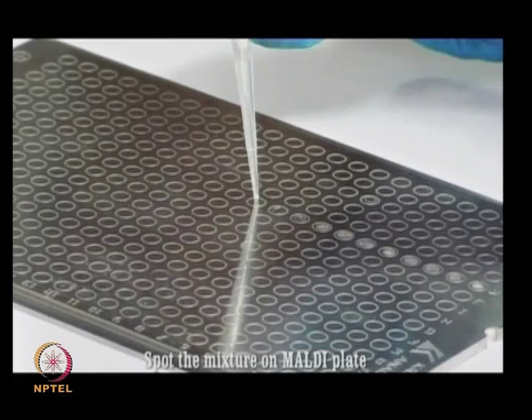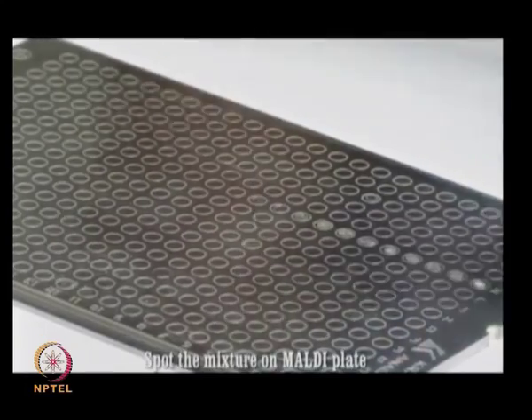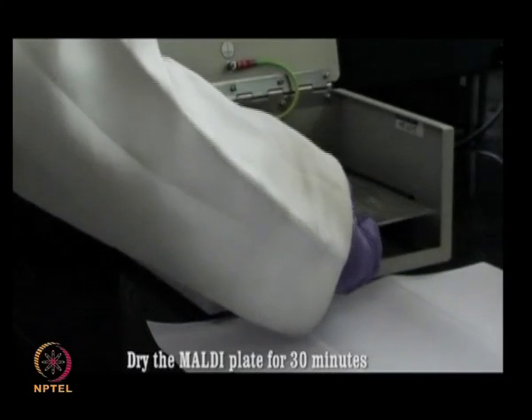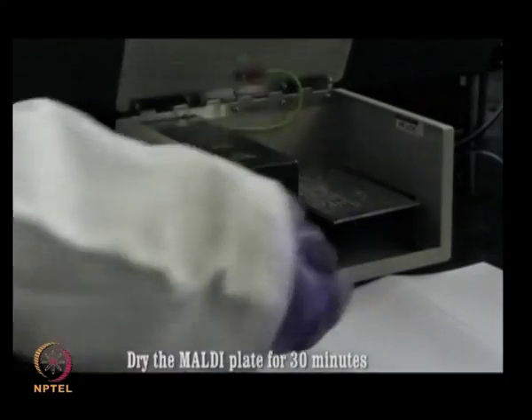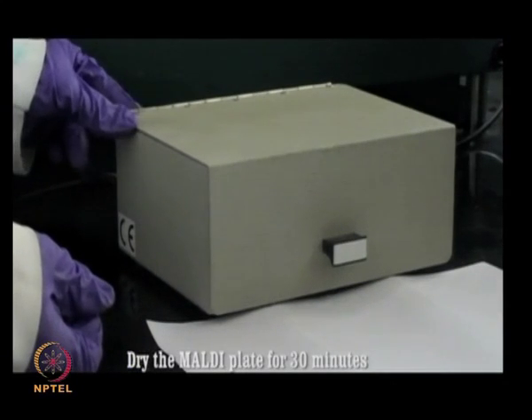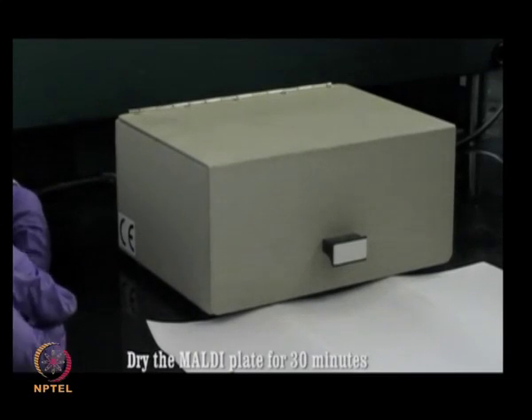How uniformly you can plate these mixtures on the MALDI plate ensures good spectra and data quality later on. Once completed on the MALDI plates, the samples are allowed to dry for 30 minutes, after which the instrument is switched on and MS analysis can be performed.